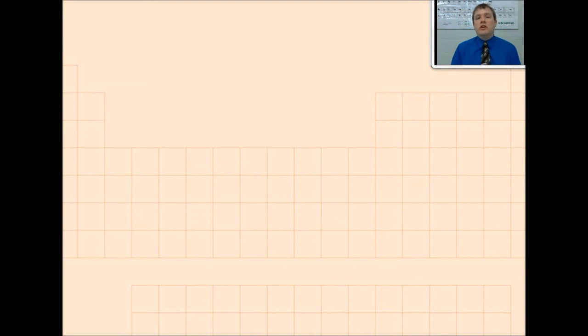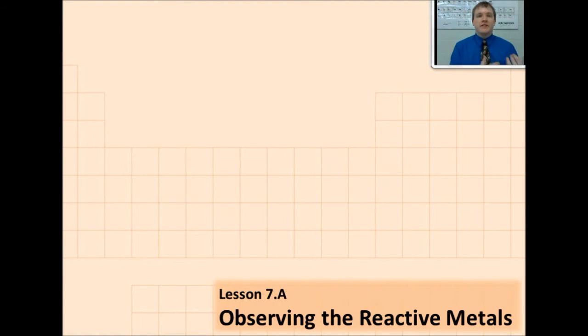In this lesson, you are going to experience through two lab demos the reactivity of these reactive metals. Let's review the properties and structures of these metals that make them as reactive as they are and give them their other properties.